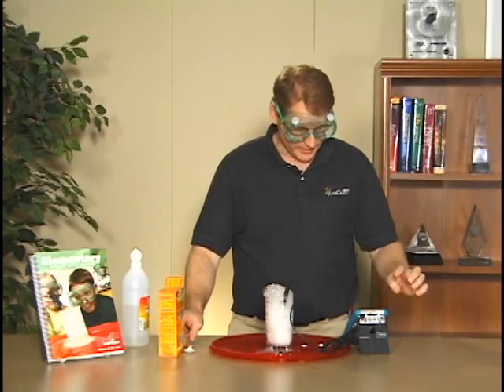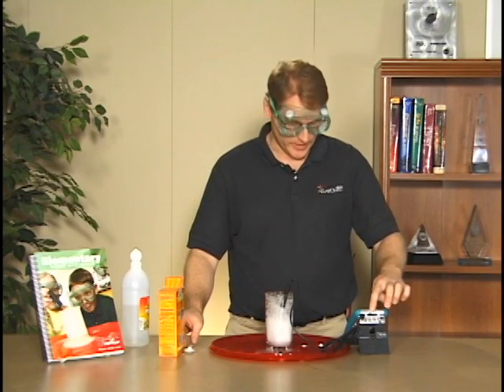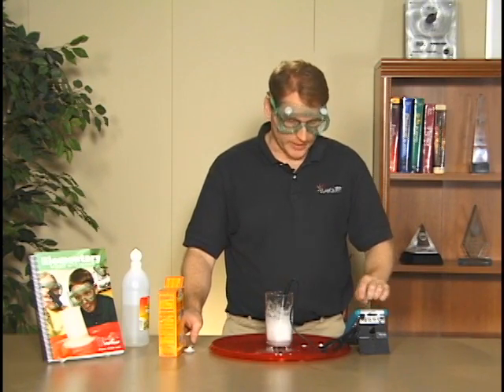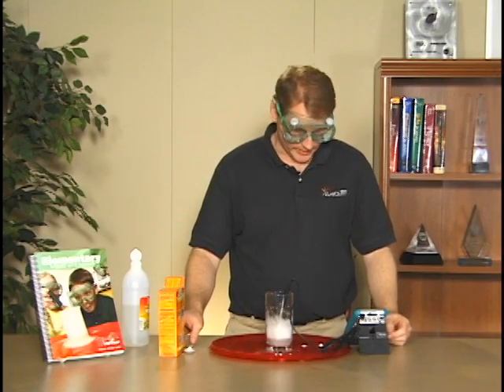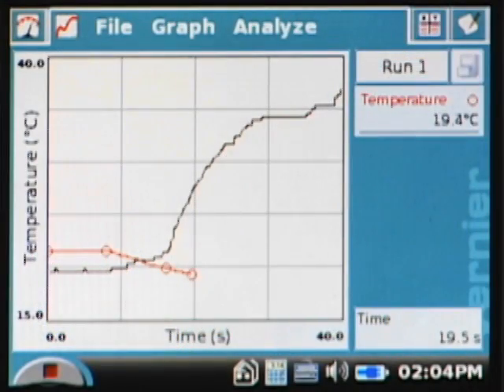The device is collecting the temperature twice a second and is drawing that graph real time as it's collecting. We actually see what happens here, and it did not go up as my prediction said it would do. It actually went down, so it was cooling off. I guess that's why they named the lab the cool reaction. It's almost finished data collection there, and 40 seconds is up.